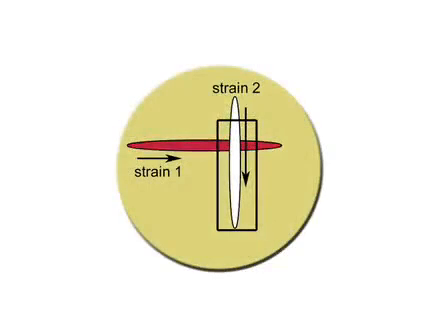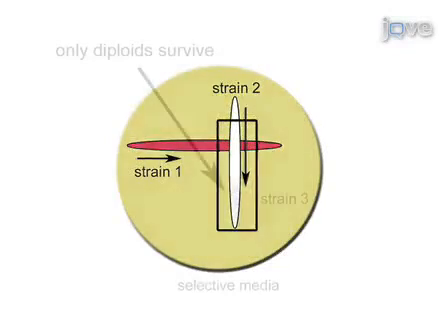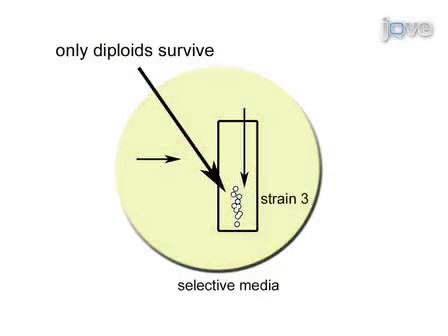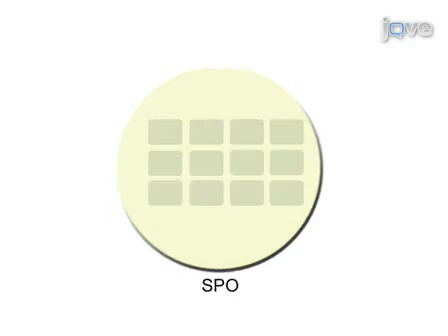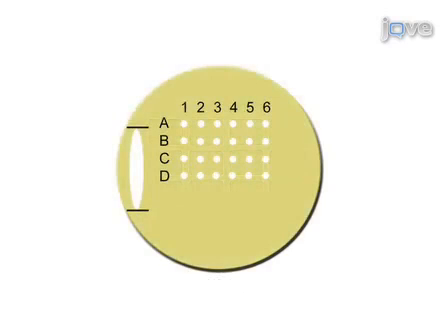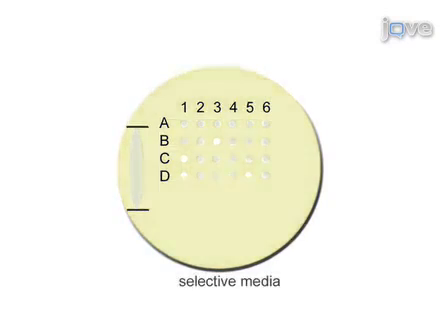This procedure begins with the mating of two genetically different haploid yeast cells. Diploids are selected by replica plating onto medium that permits growth of only the diploids. The diploids are then patched onto sporulation plates, or asci form. The asci are dissected with the haploids placed in a defined location on the plate. Once the resulting haploids have grown to a visible colony, the plate is replicated to selective medium to identify the genotype of the individual cells.